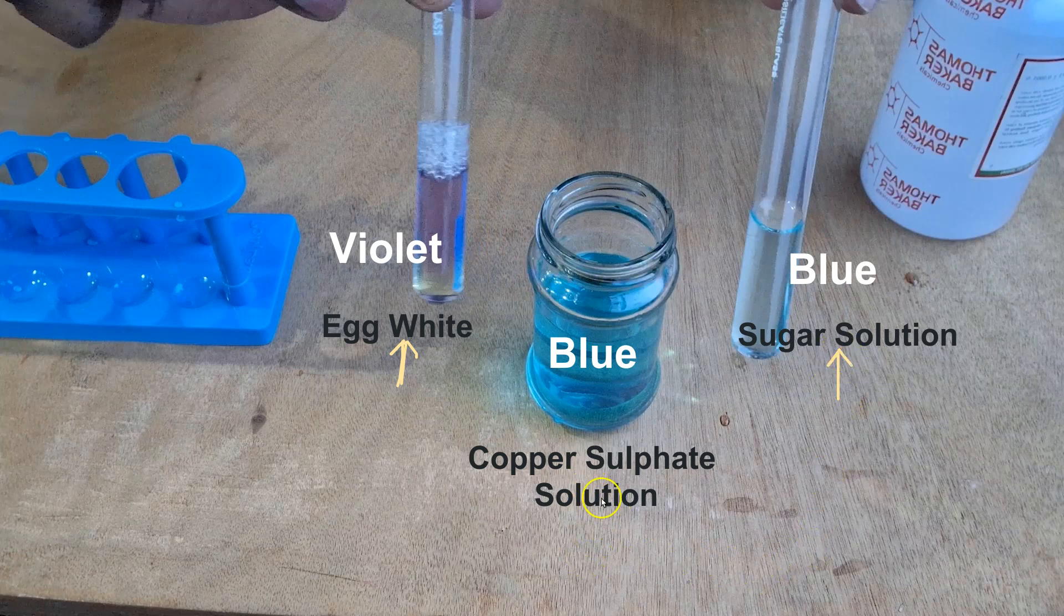The copper sulfate solution is also blue. You'll notice that the sugar solution just looks like a diluted version of the copper sulfate solution, whereas the egg white is a totally new color.